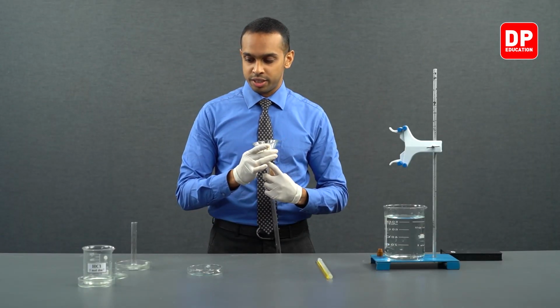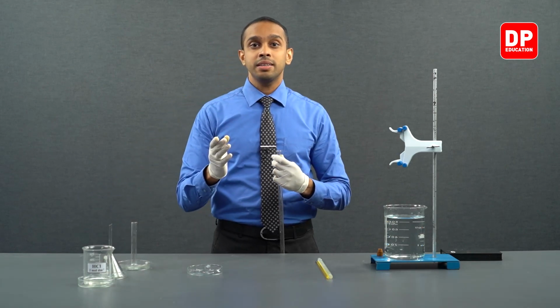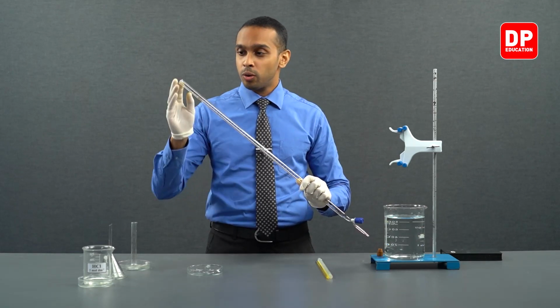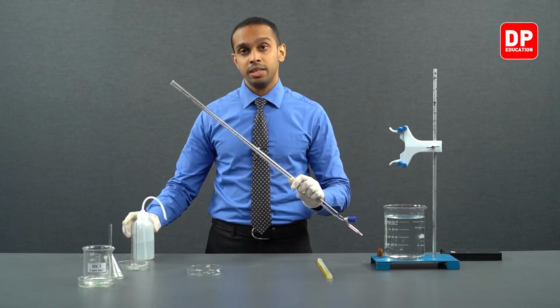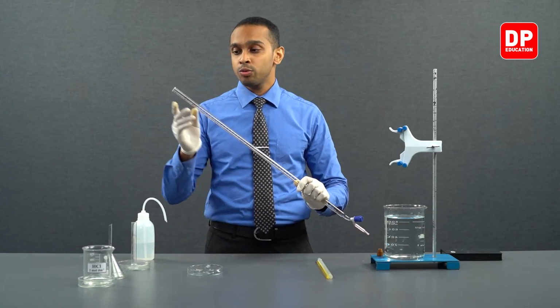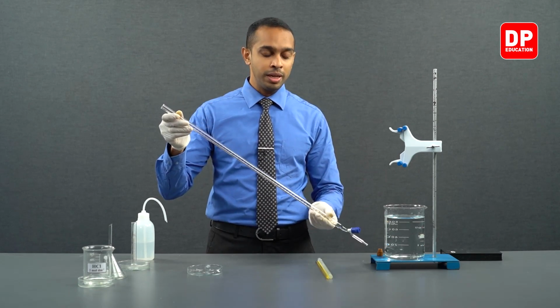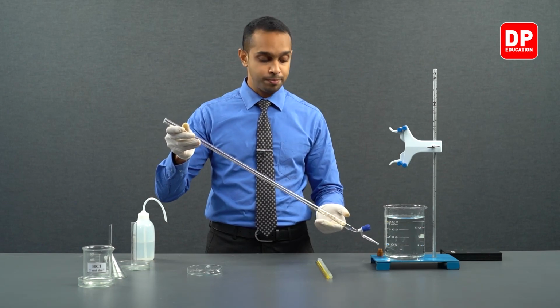After adding our HCl, we are going to add some water into this burette. We have to fill this burette all the way up to the top with distilled water. Like we did in the first trial, we will be adding water along the wall of the burette so that it doesn't mix that well with the HCl layer that we have at the bottom of the burette.